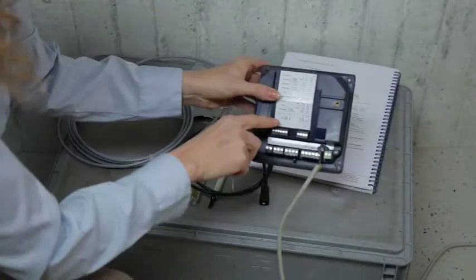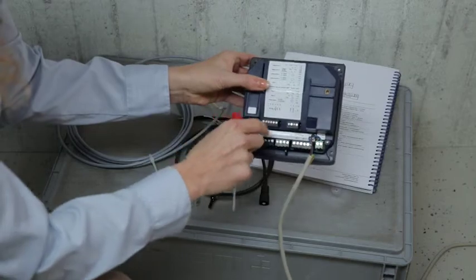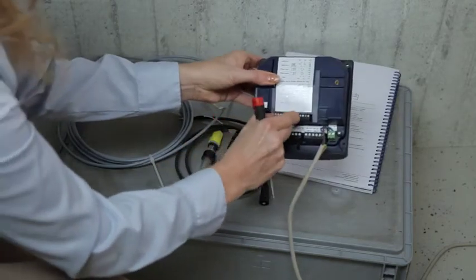The connection points are marked in the connection diagram, contained in the manual as well as on the device.